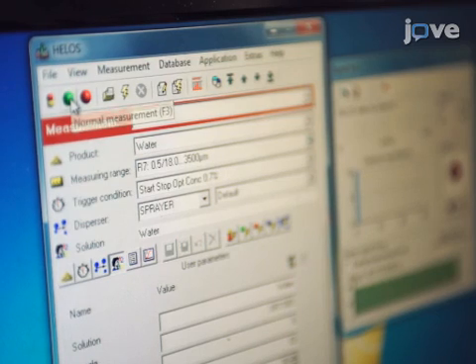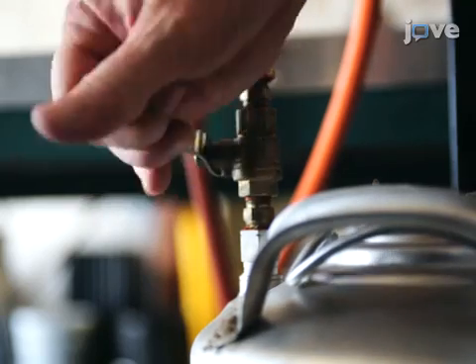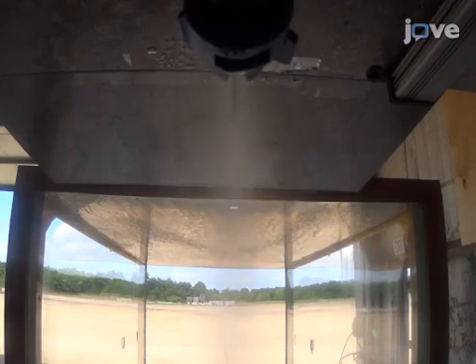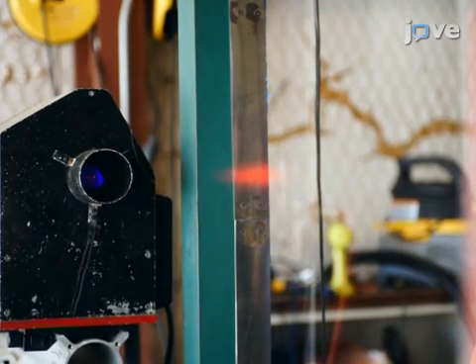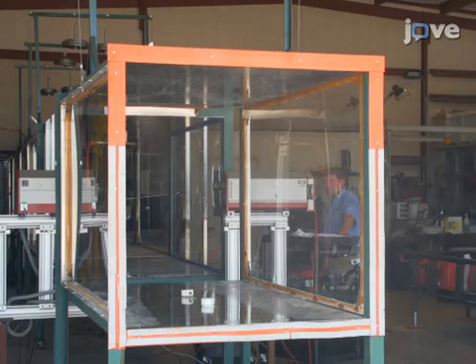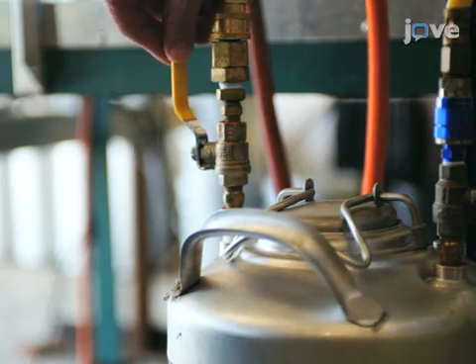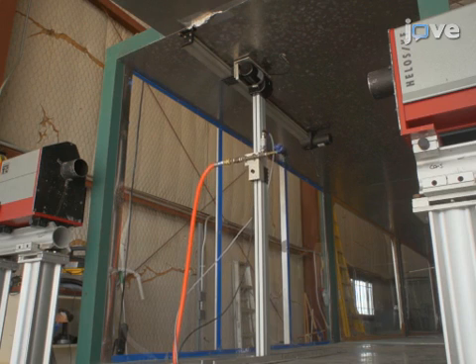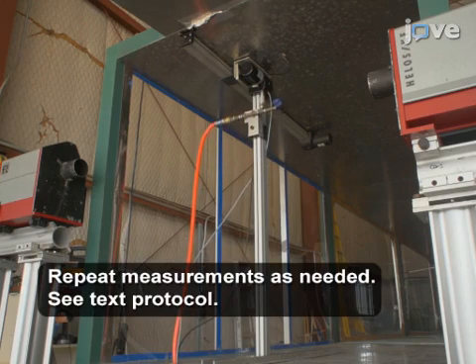Continue by initiating a measurement cycle. When the system is ready, open the liquid feed valve from the pressure tank. Once the spray starts, use the traverse mechanism to lower the nozzle until the entire spray plume has passed through the laser diffraction system's measurement zone. After the measurement, close the liquid feed valve. Then return the nozzle to its highest possible position in order to repeat the reference and plume measurements.